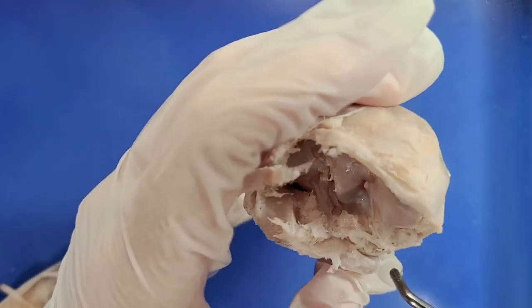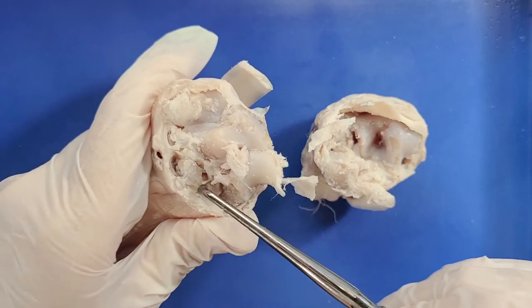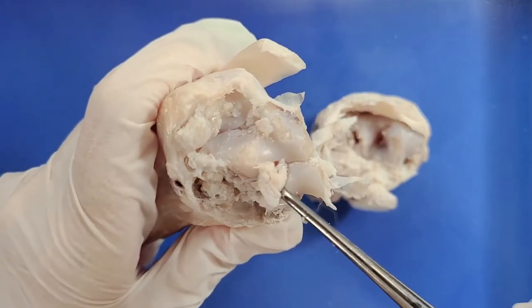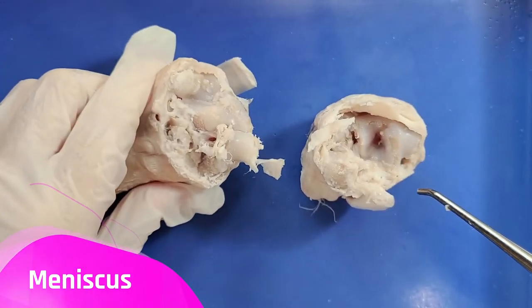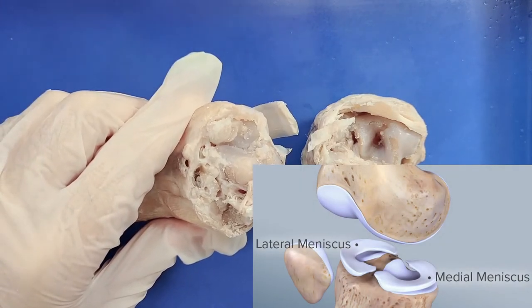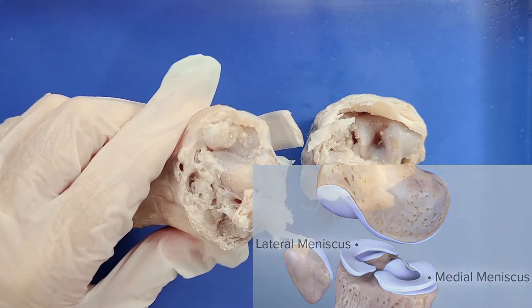Now when we look inside the knee joint, we can see this thick part of cartilage right here. This is called a meniscus, and the function of the menisci is to reduce friction and absorb impact when the knee is moving or bearing weight by acting as little cushions.